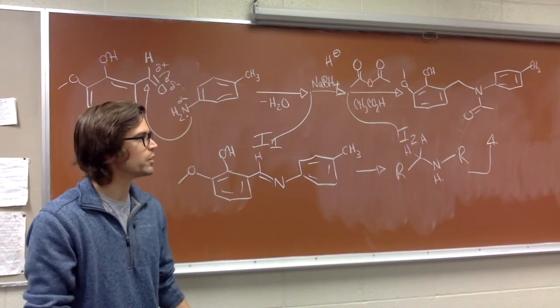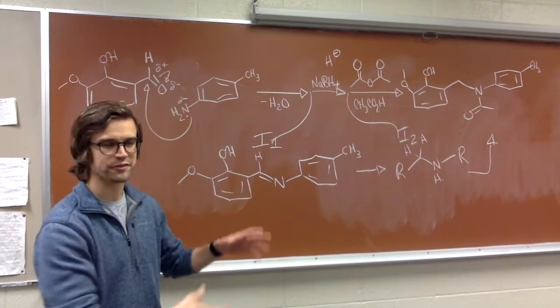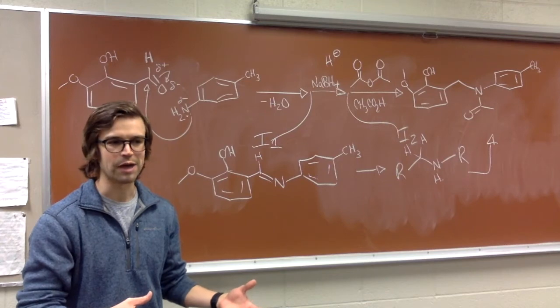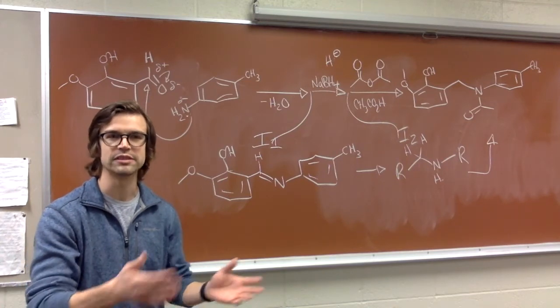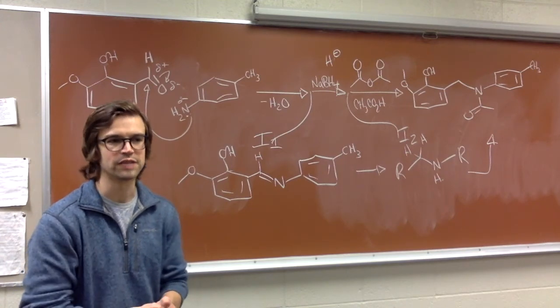And one thing, this is kind of setting us up for the labs in the future. This is the biggest molecule you've ever made. So analyzing it by proton and carbon NMR is going to be a little bit more complicated than what we've seen in the past as far as bromoalkanes and those types of things.